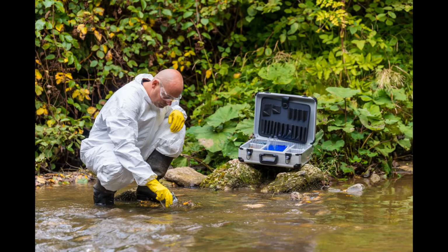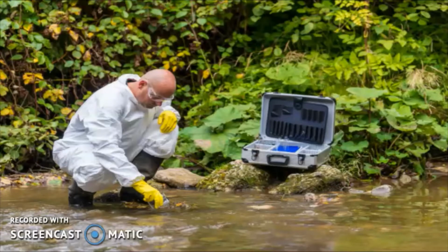Often scientists want to understand more about the state of something. They may be looking to gather data from rocks or soil samples, could be a stream or the atmosphere. In order to test these parts of our ecosystem, we often need to use specialized testing equipment. In this lab, we'll be looking at tests for nitrogen, phosphate, and dissolved oxygen.